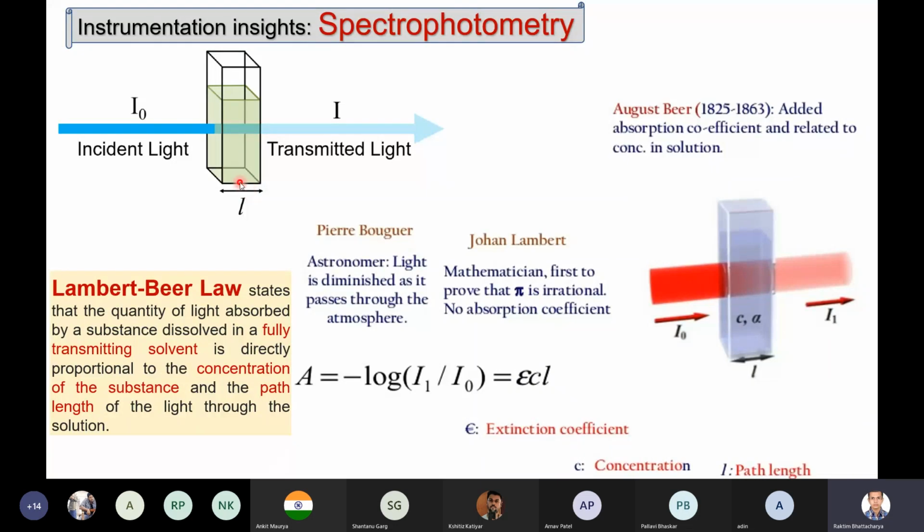So by taking the cuvette and putting the solution in it, you can easily say that you have put this much amount of solution in it. This is the main purpose, that it gives you a specific volume of the solution, and also you get the exact area which the light is traversing. This is required when you are going to measure the optical density.